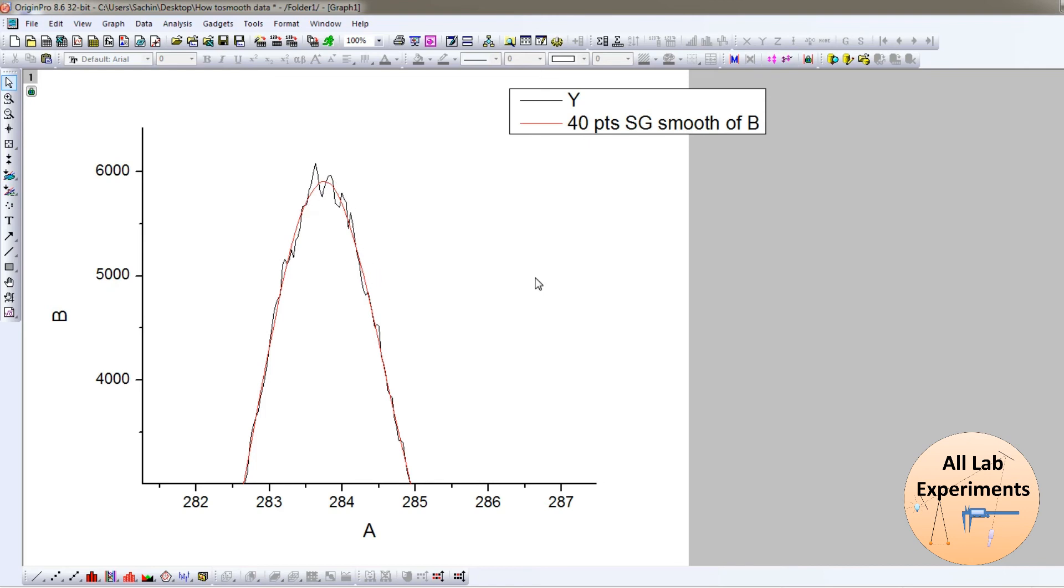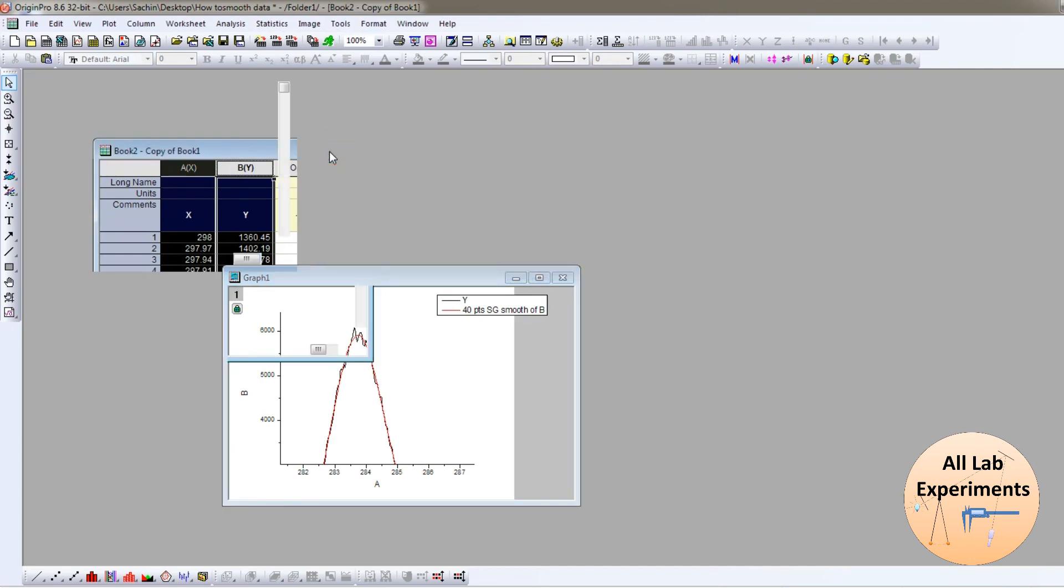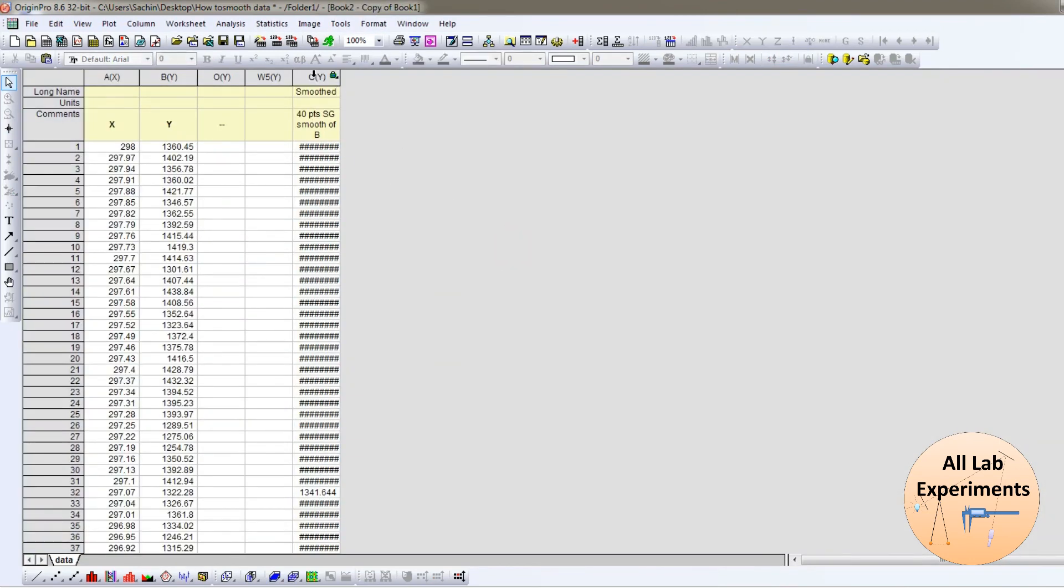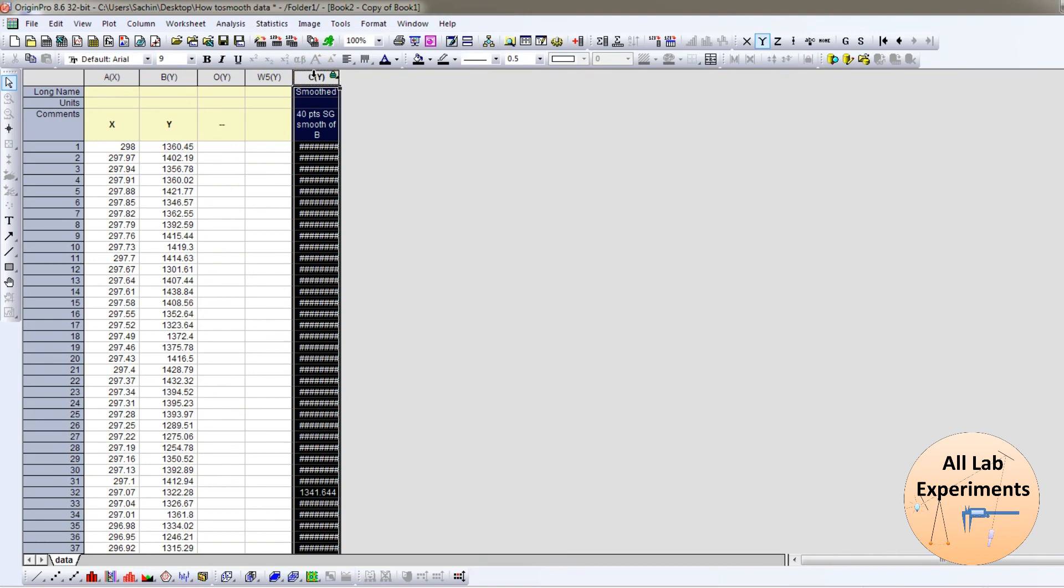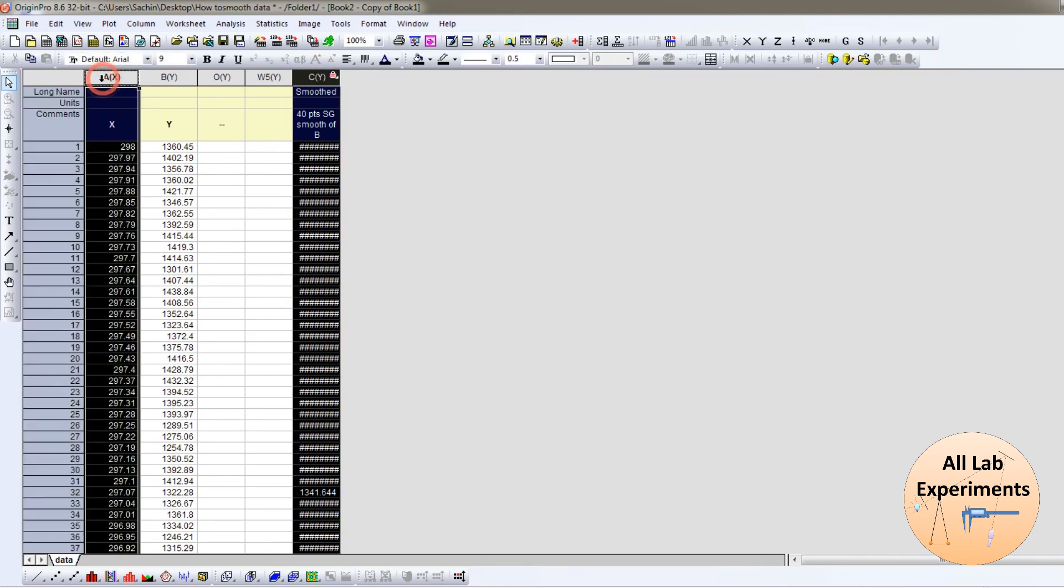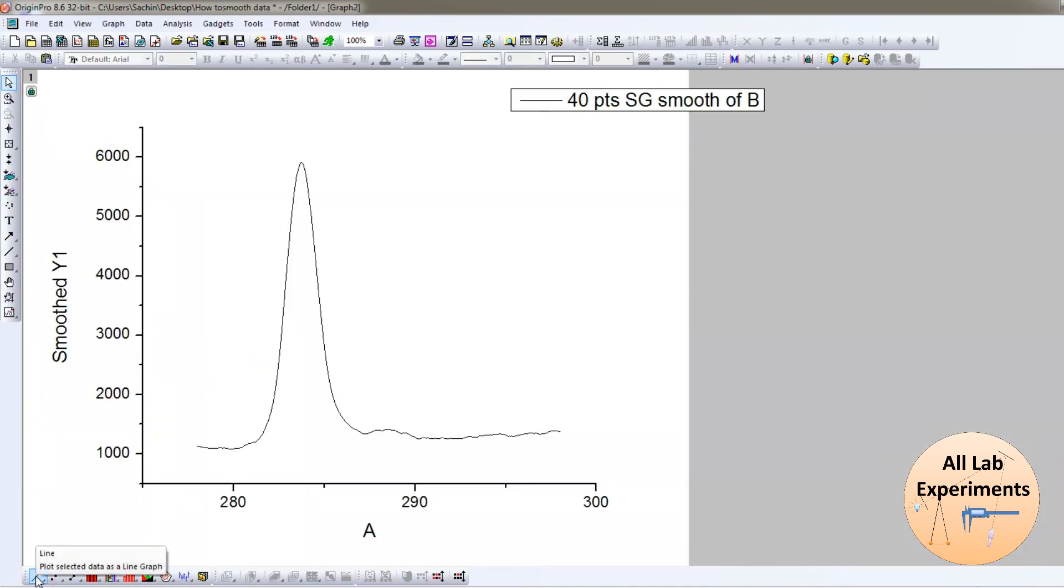Now here I am getting one black line which is my original data and one red line which is the smooth data. If I want the data of this smooth curve, I will go to my book, and in this book I have this smooth data. If I like to plot this, I will get this smooth curve which contains almost every information of our data.